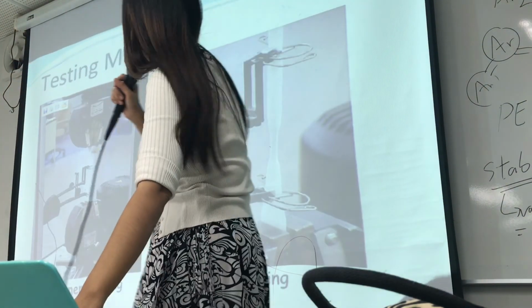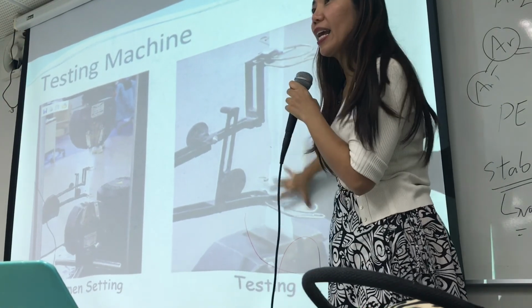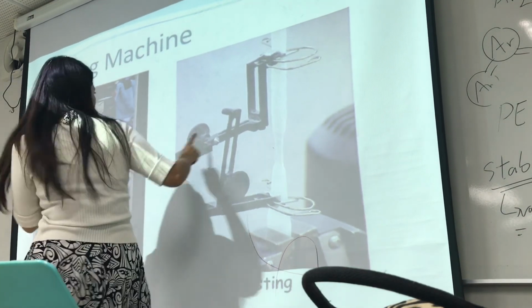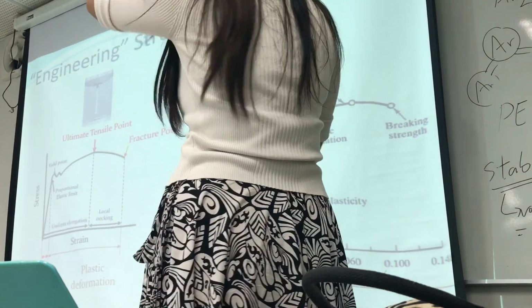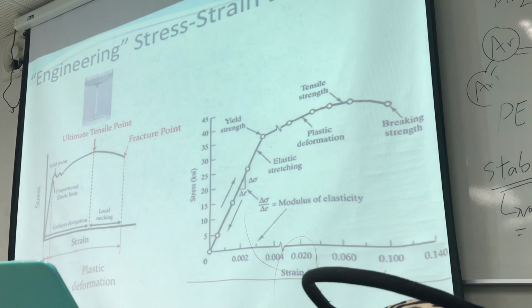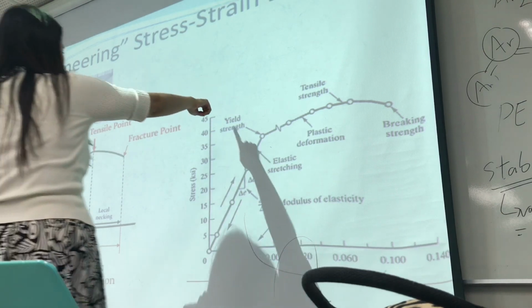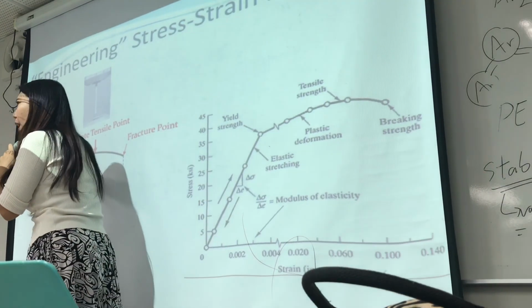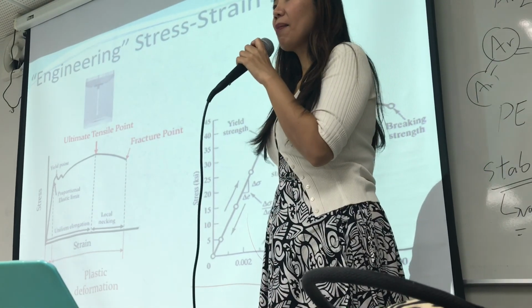What's happening is like that. See that? This is the dog bone and this is the strain gauge. This is used to do the measurement of a polymer tube. After we get the result from that machine, what you can get is a stress strain curve. A stress strain curve can be this shape, like this, or it can be as simple as this.